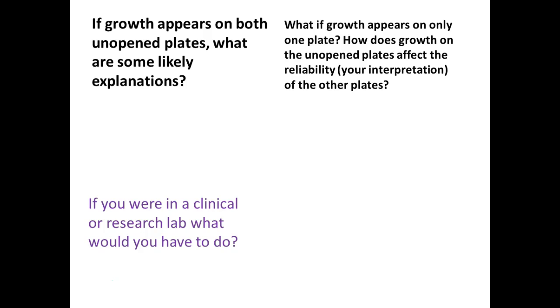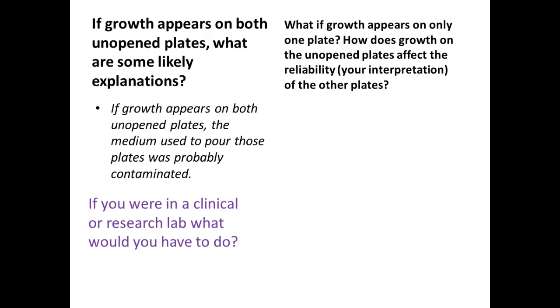We come back next week and look at these plates. If growth appears on both of our unopened plates, that's not good. Likely explanations: they were contaminated. How? The food source, the petri dish, or the person making the prep. In a clinical or research lab, since our negative controls didn't come out negative, we couldn't trust the rest of the experiment — we'd have to do it again. But this is a teaching lab, so we use it as a teaching moment.